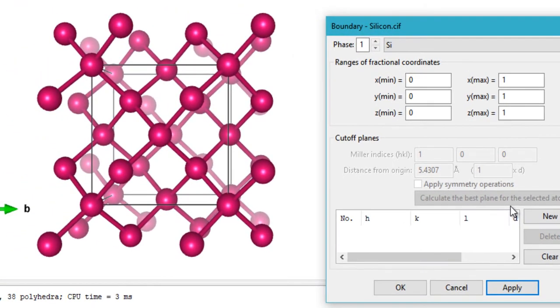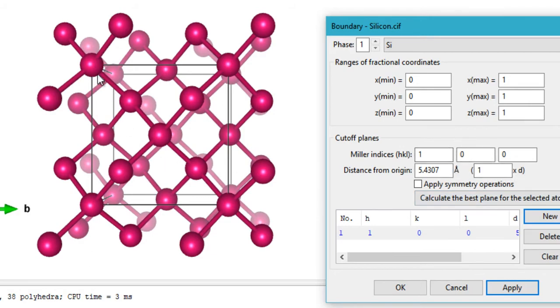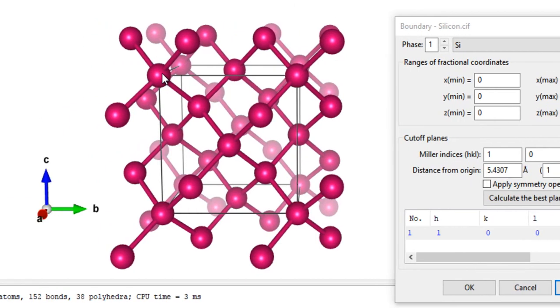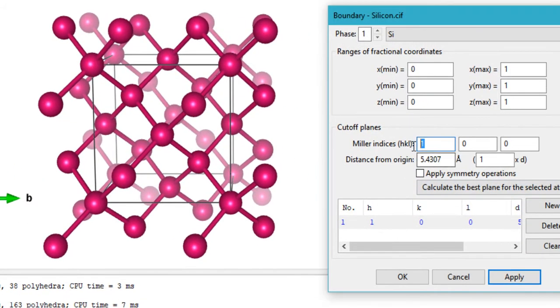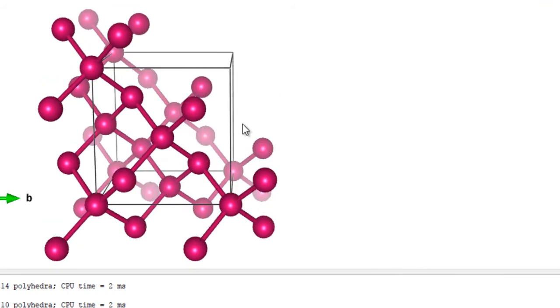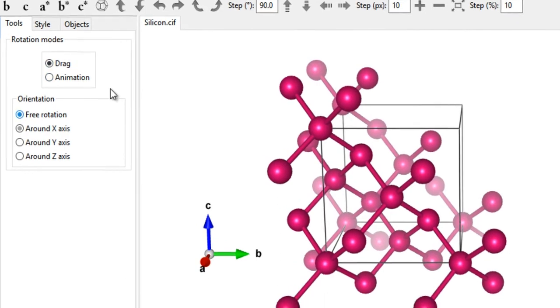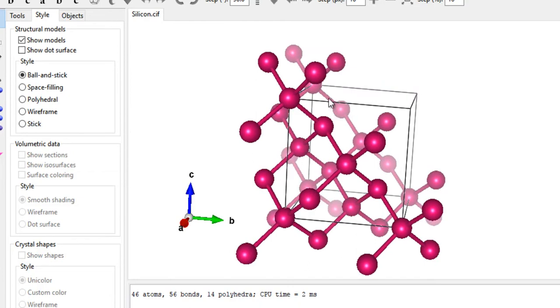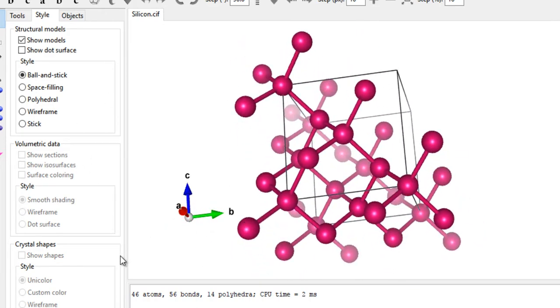You can revert to a single unit cell by setting all values back to 1 and clicking Apply. You can also cut off atoms using a lattice plane — for example, specifying a 0 1 1 plane and clicking Apply creates a boundary at that diagonal plane, removing all atoms below it. That covers the Boundary section.